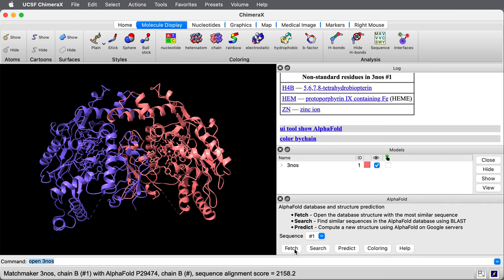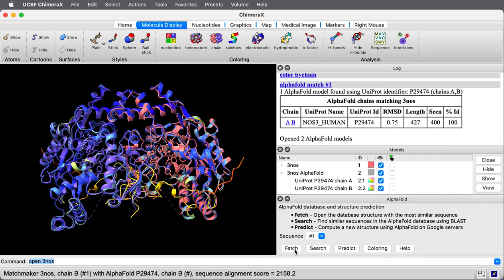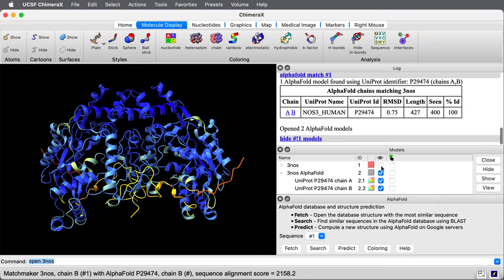If I press Fetch, it will load from the PDB database of these pre-computed AlphaFold models the AlphaFold prediction. I'm hiding the experimental structure. Here's the prediction.